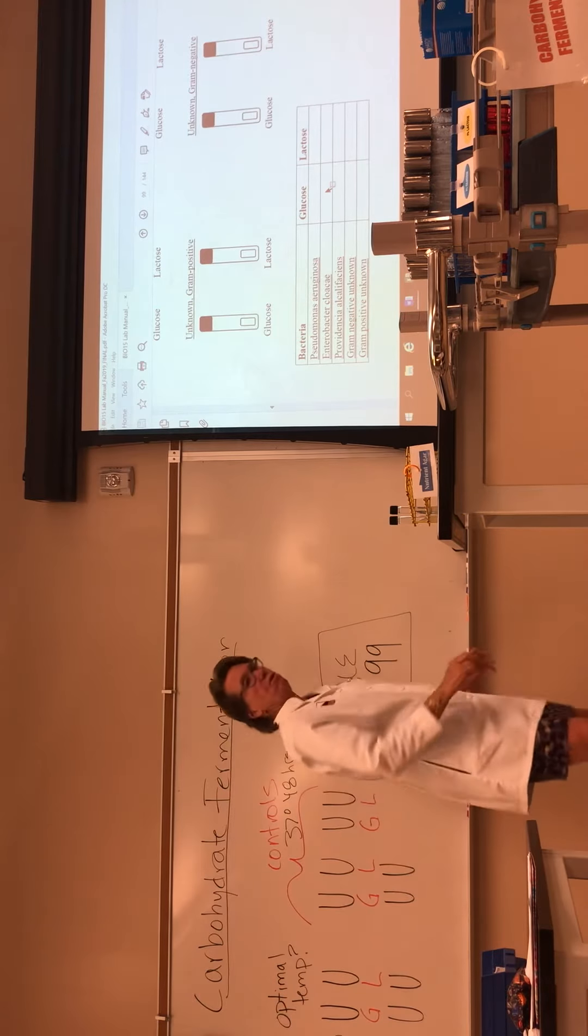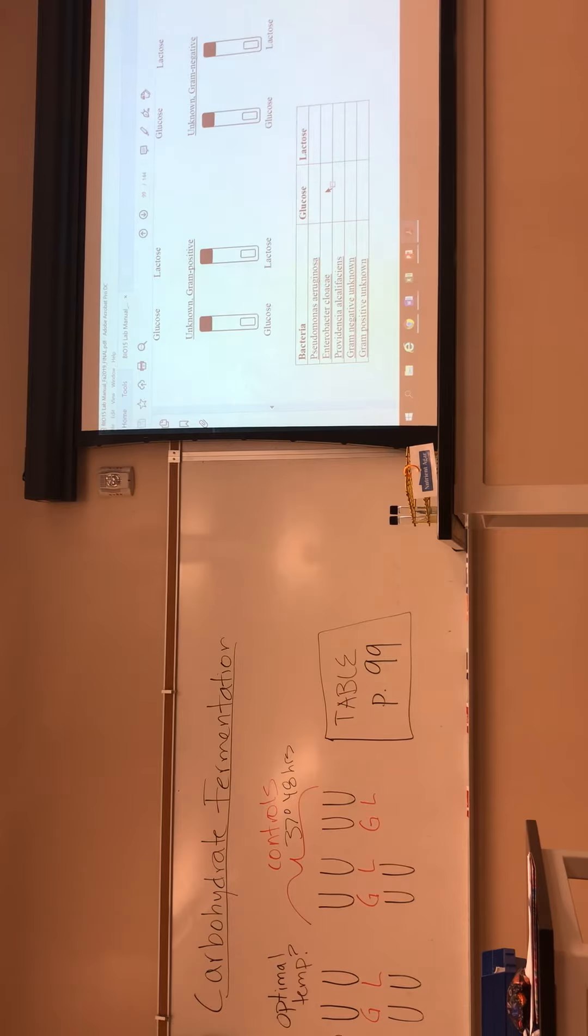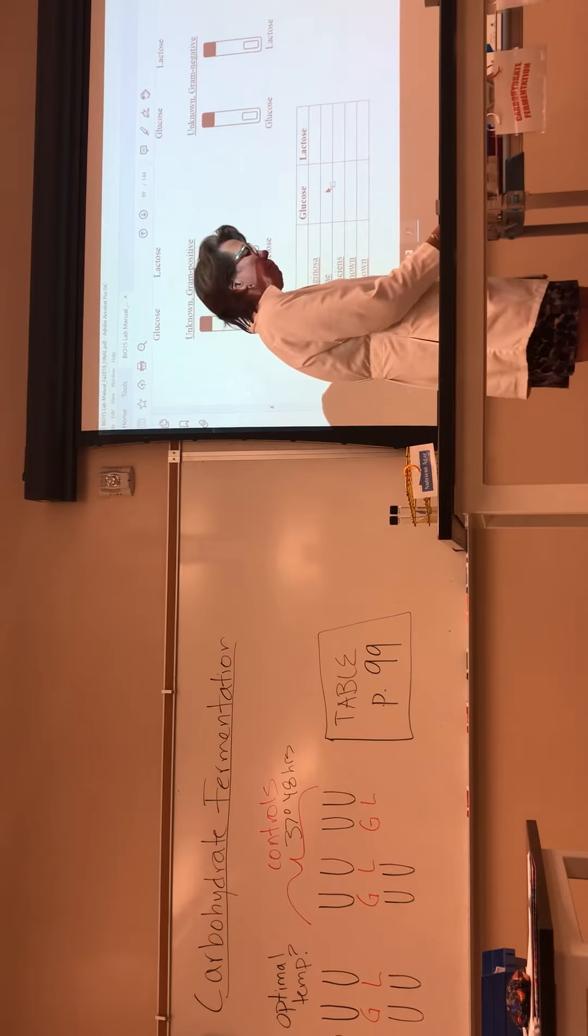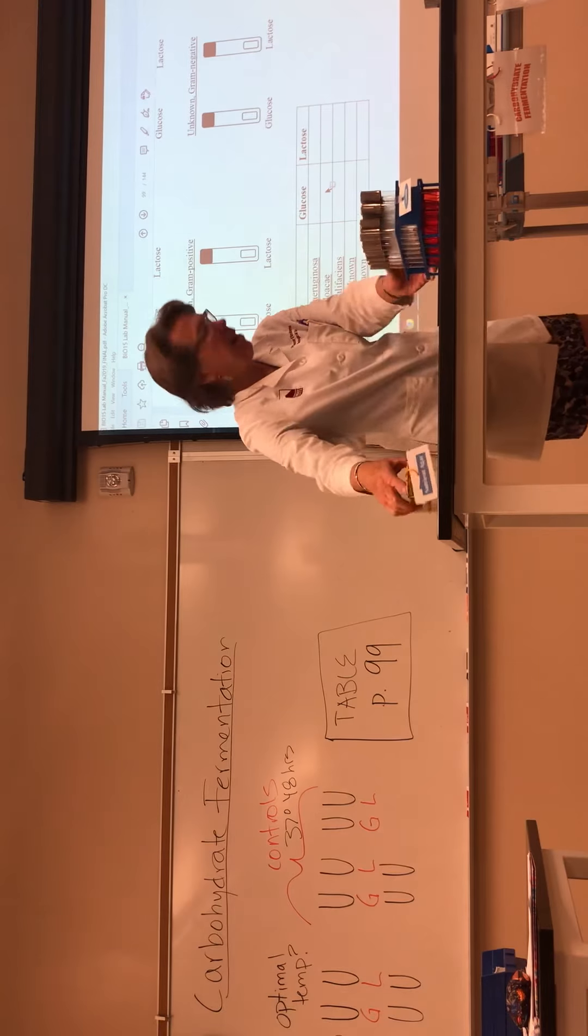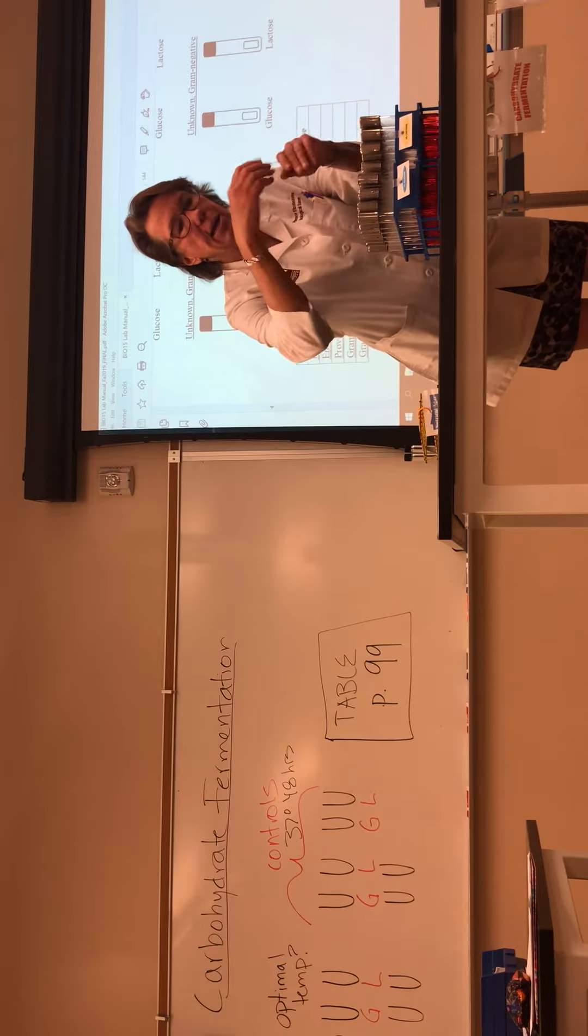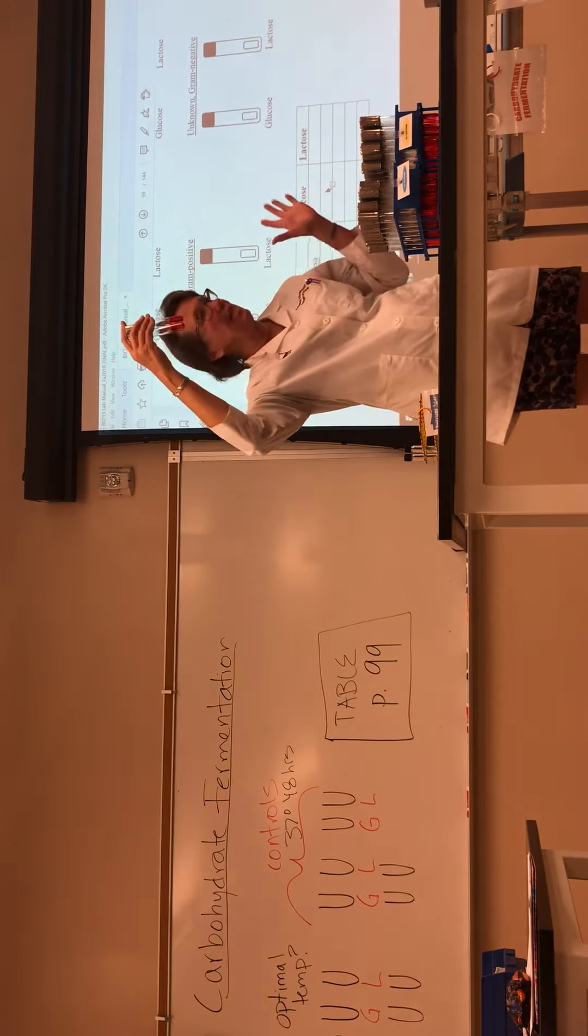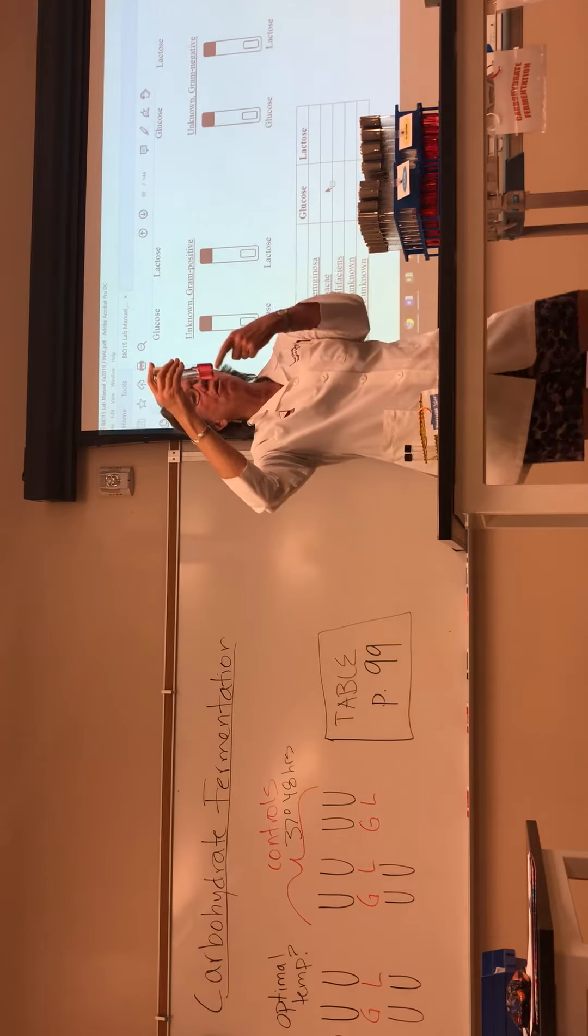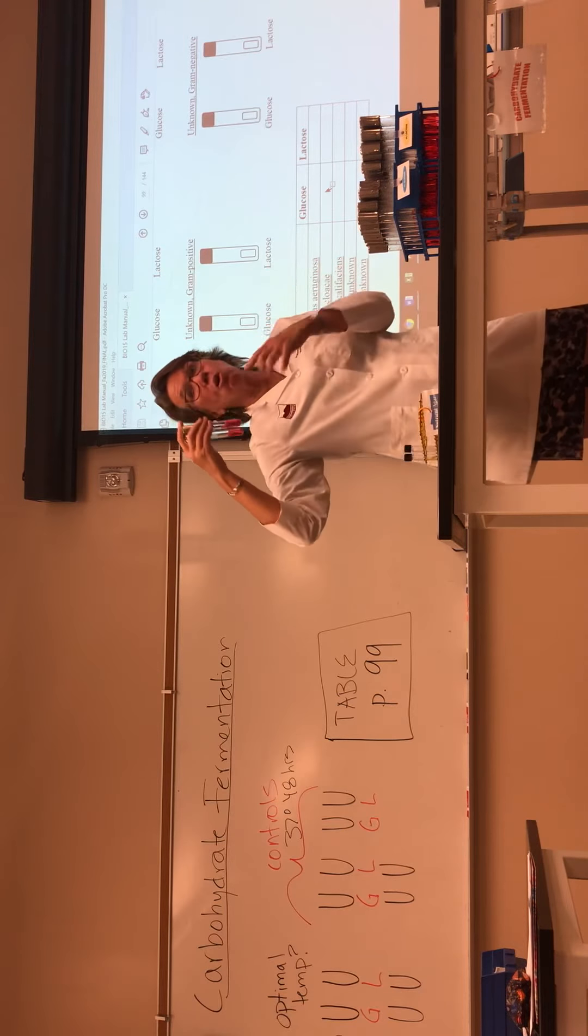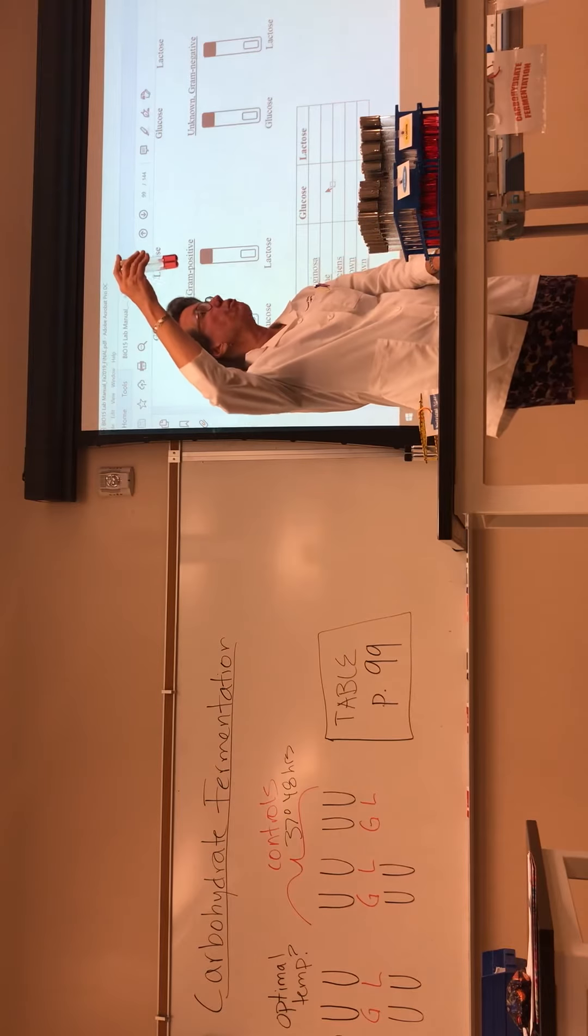Let's take a look at what these tubes look like. Glucose or lactose are sugars dissolved in a broth, and the broths look sort of orangey red. The reason they look orangey red is because in addition to the glucose or lactose, which you can't see but it's in there, you're going to have to trust us, there's also a pH indicator. That pH indicator is phenol red, and at neutral pH, it's about this color, sort of an orangey color.